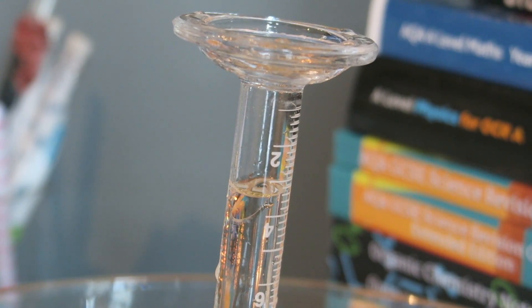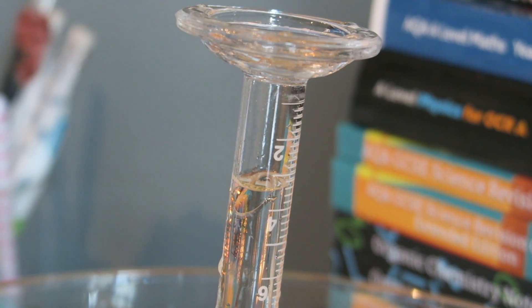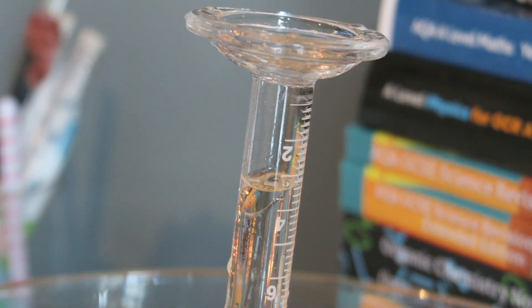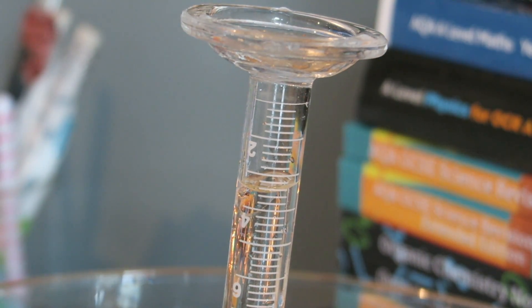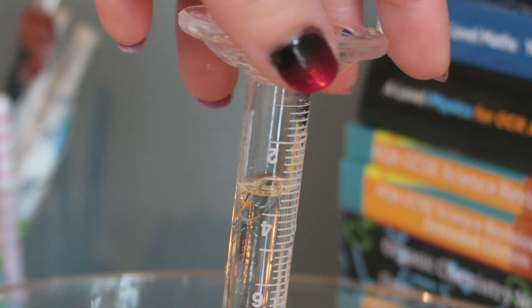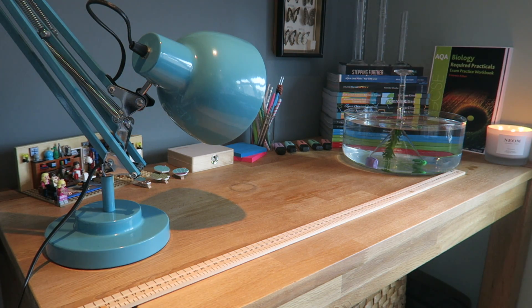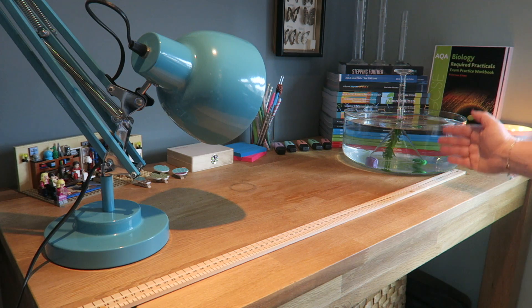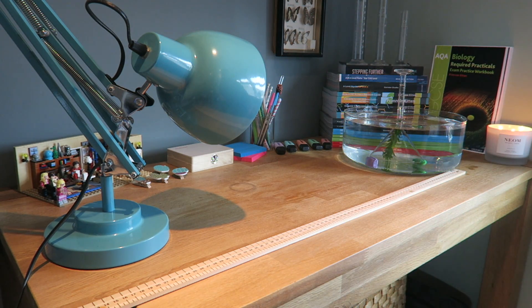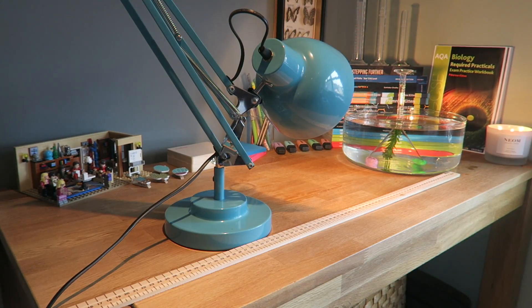You can see there's a gap at the top of the measuring cylinder — this is absolutely fine. There are two different ways of doing this experiment: we can count the bubbles being released, or we can record the volume being released. We just need to make note of the starting volume and the final volume so that we can record any volume of gas released. We can now introduce our light source, and we have our meter ruler here. We're going to be sequentially moving the distance from the pond weed to the light source. I've got the light source on — I can record it for 15 minutes.